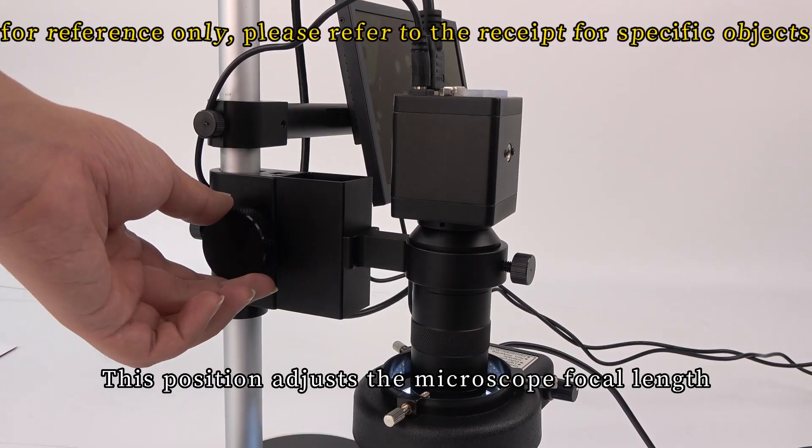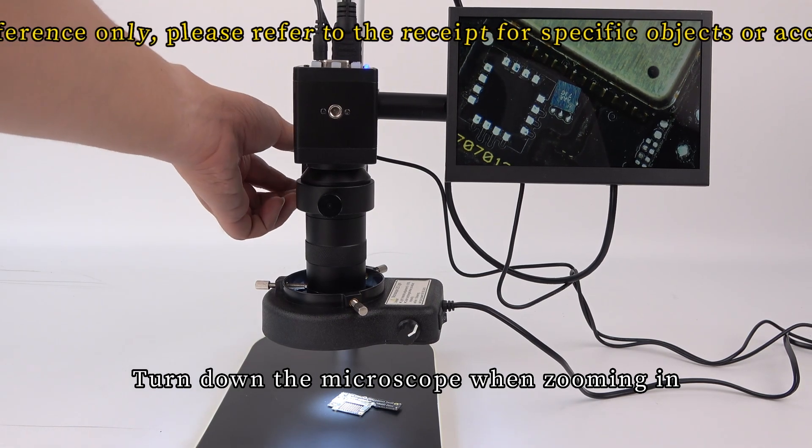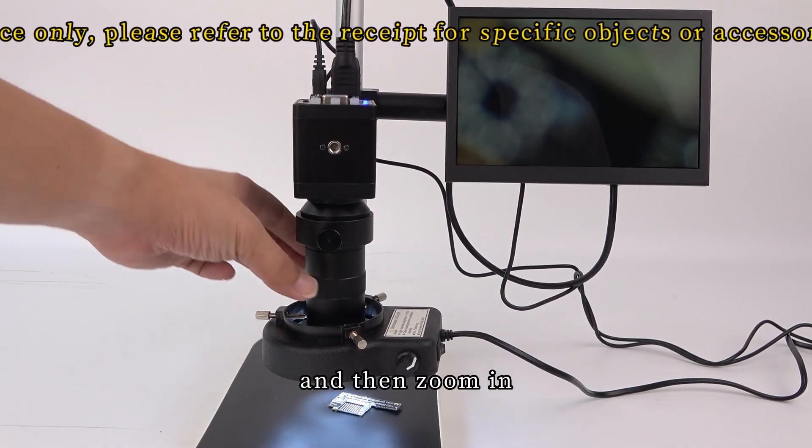This position adjusts the microscope focal length. Turn down the microscope when zooming in, and then zoom in.